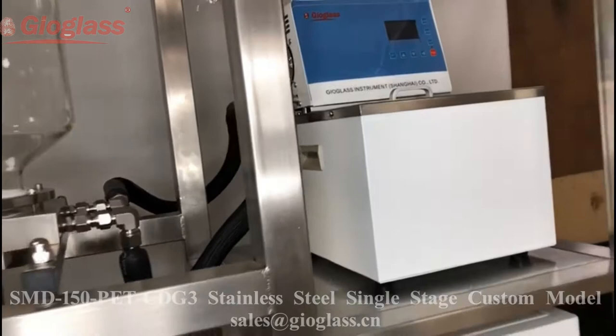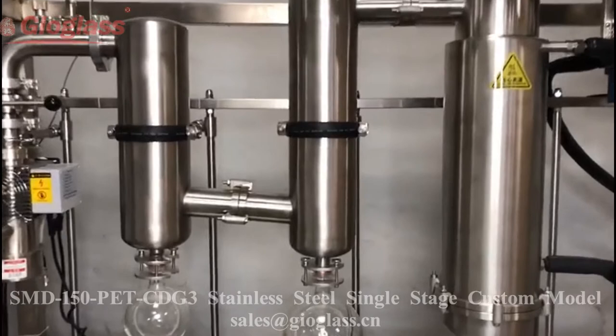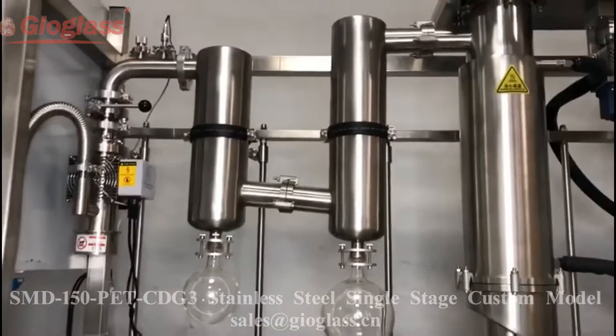E is for the external condenser. This is the external condenser. We provide a chiller for negative 20 degrees Celsius.